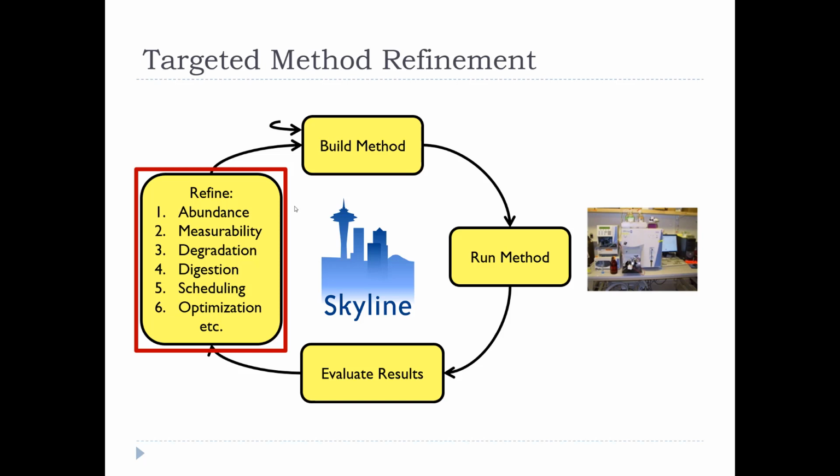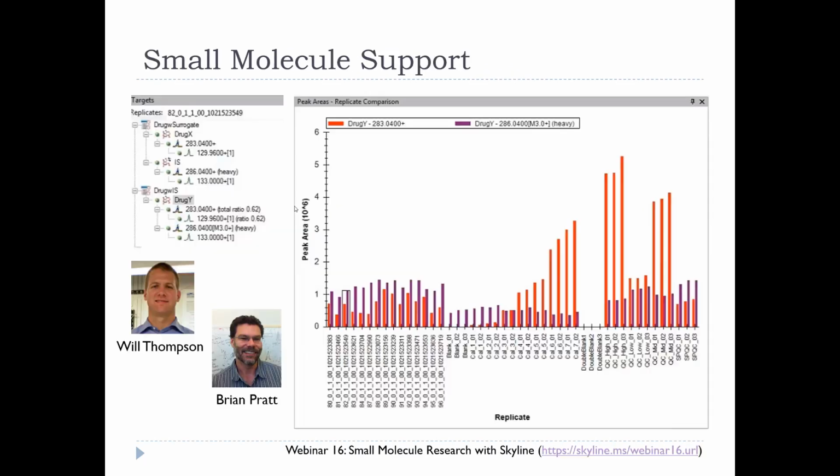But if we had full knowledge of all of this information, we might choose to use it even on a discovery experiment, right? We don't necessarily just need to target everything. I mean, it would make our numbers of peptides measured go down, and everybody likes to see, oh, I measured 50,000 peptides, but we might actually get more precise measurements of the proteins we're interested in.